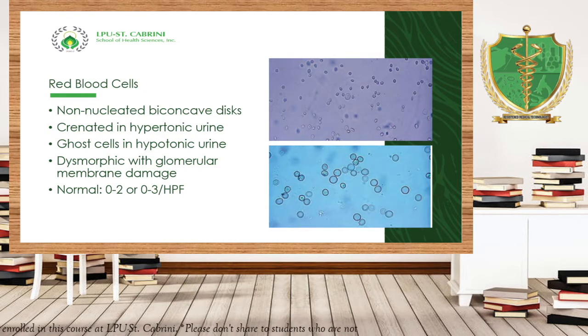Okay, so I am sure that you are all aware that our red blood cells are non-nucleated cells and appear as biconcave disc. No? Siguro naman, you were able to see the structure or how our RBC looks like under the microscope, no?